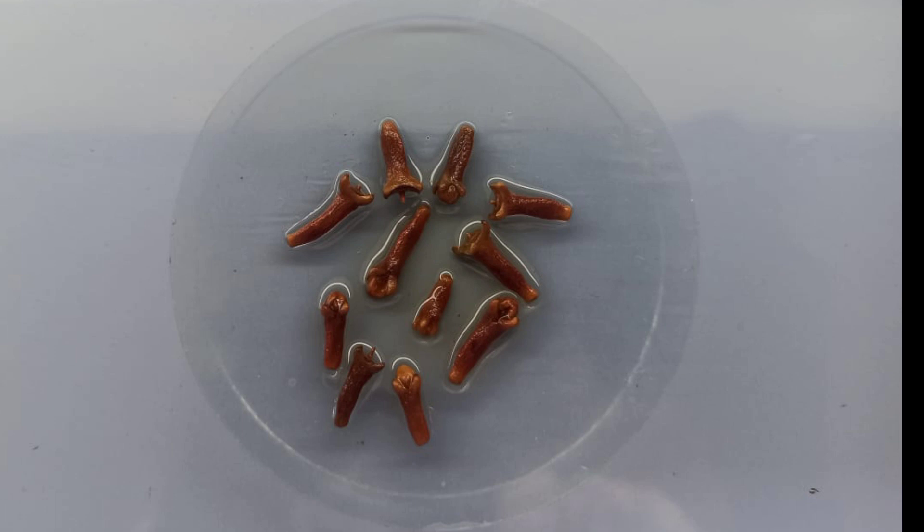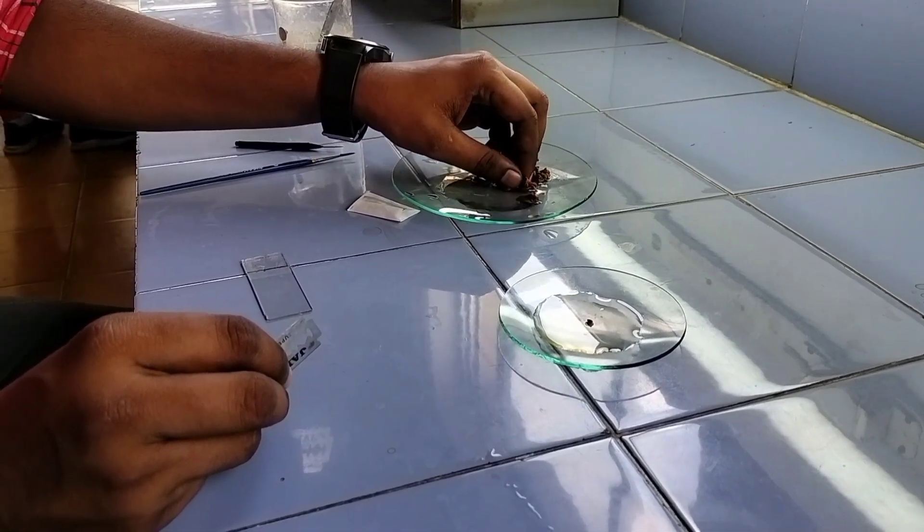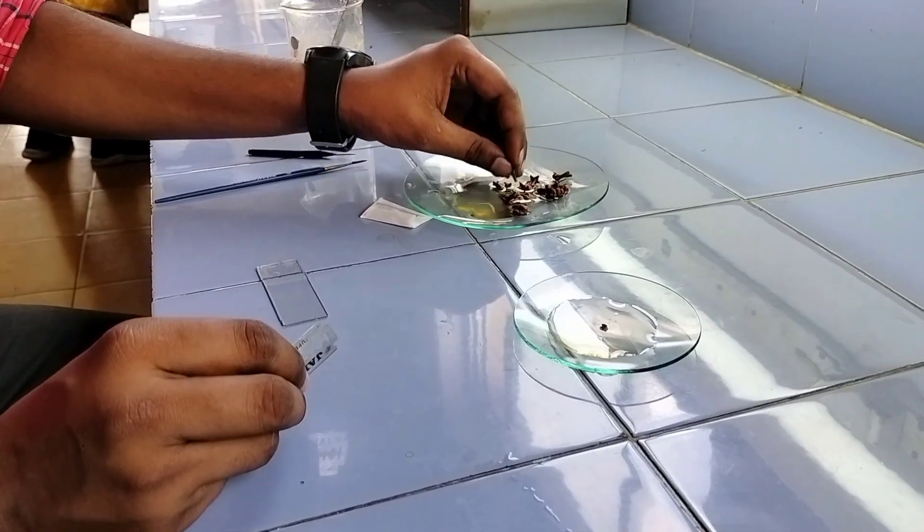Now let's study the Transverse Section of Clove. To study the Transverse Section of Clove, the Clove bud should be immersed in water. Initially, go for the hard cut, followed by a thin section — as thin as possible.